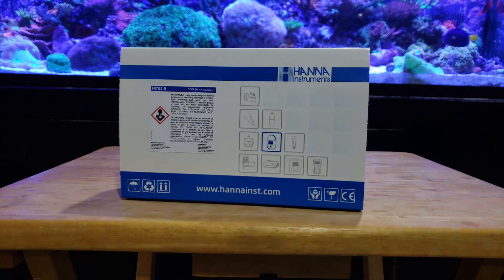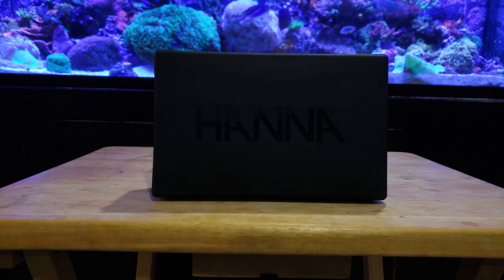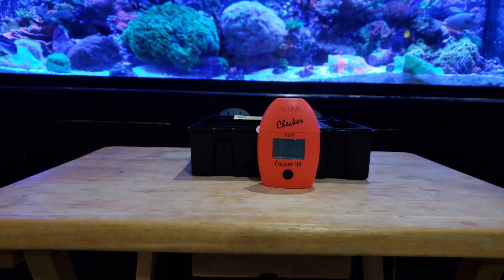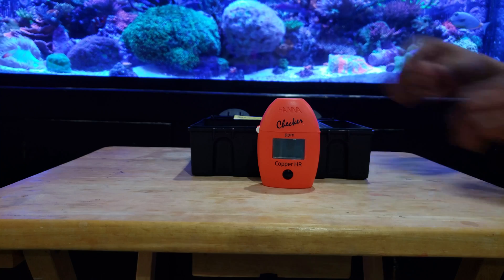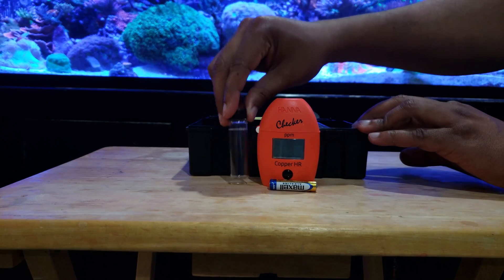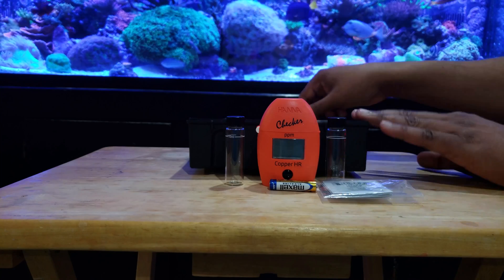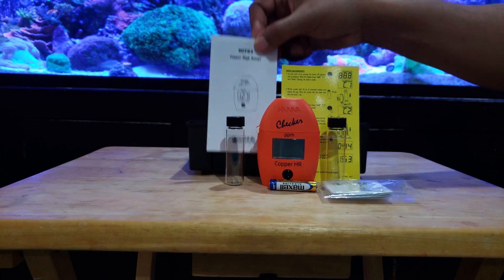So what do we have here? We have the black case that Hanna sends with all of their newer meters. The case says Hanna on it — it's a nice thing to have if you want to travel around, and you never know, you may want to test one of your friend's water. Inside the case you have the red test egg, or the meter — this is the HI-702. It comes with a battery, two testing vials, and six test reagents. You definitely want to go order more when you get this. It also has the quick reference and instruction guides in the case.